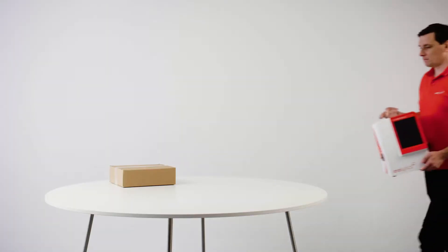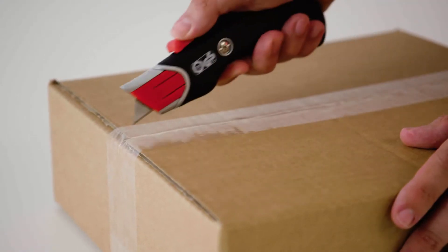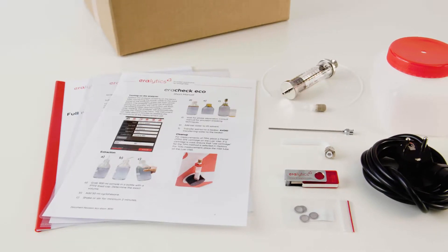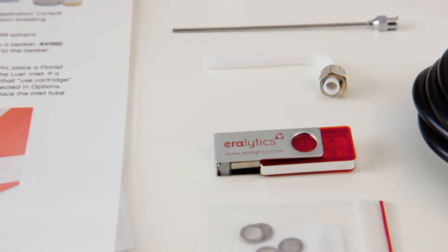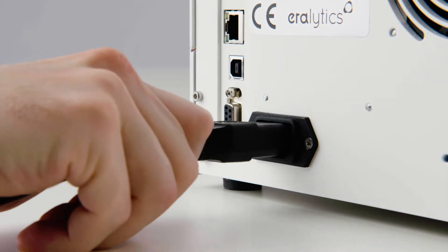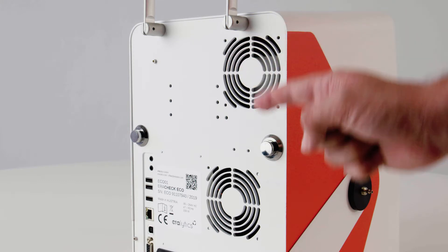Installation. Place the instrument on a stable benchtop. Open the accessory box. It contains instrument-specific items, the printed short manual, and the USB drive with the full user manual. Plug in the power cable on the rear side of the instrument. Make sure that the vent holes are not obstructed.